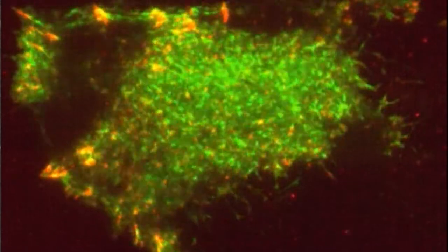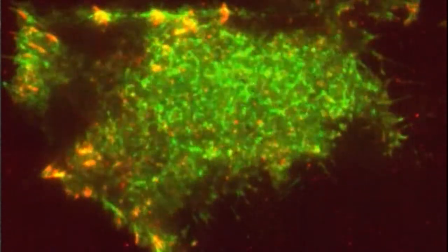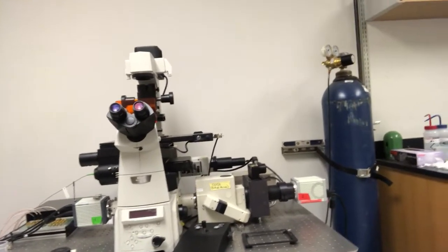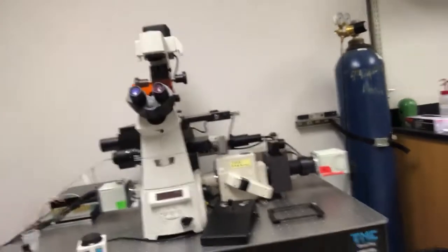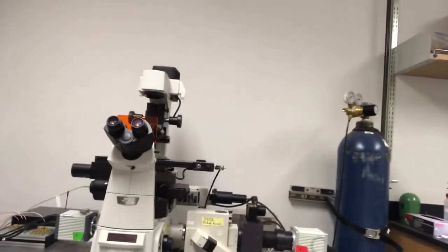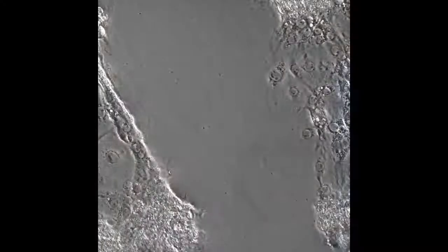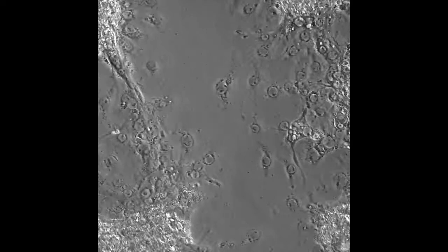On the other side we have a spinning disk confocal arm, basically, and that allows us to actually go up and down in focal planes when we're studying cells. So on one side, TIRF pretty much limits us to the bottom with a really good signal-to-noise ratio; on the other side we have confocal, also really good for live cell imaging, but we're not stuck at the bottom. This microscope also does epifluorescence microscopy and phase contrast microscopy.